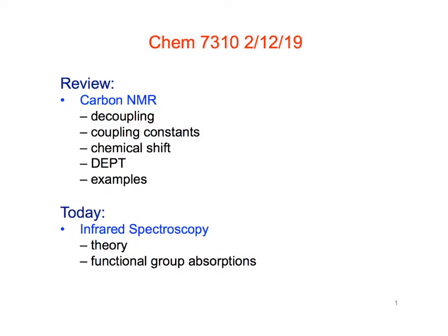And so we'll go a little bit over just some very basic theory. And then the main thing about IR is we'll just go through and look at examples of functional group absorptions. Okay?